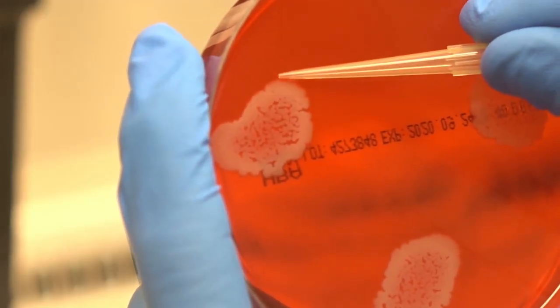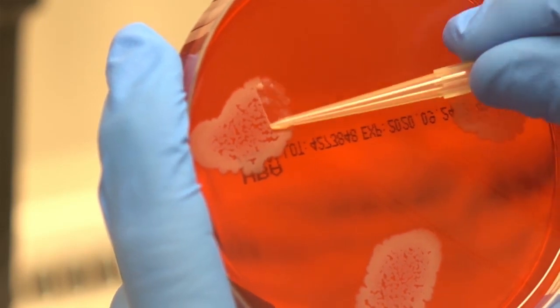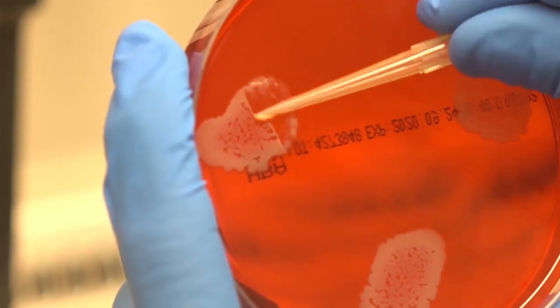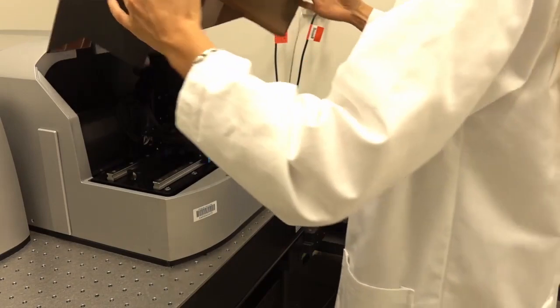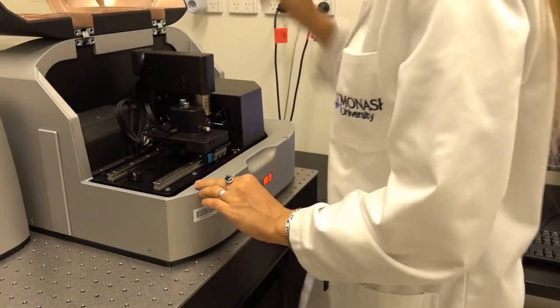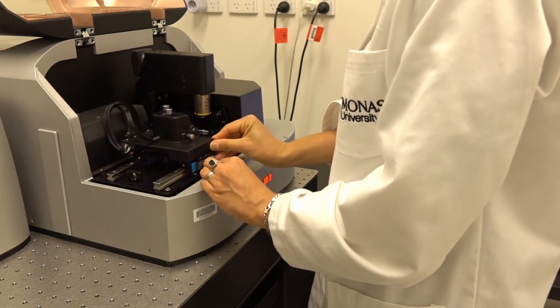Nanoscale size of bacteria significantly limits the available research tools capable of probing their chemistry. AFMIR allows us to do it in a non-destructive, observer-independent manner, even on a subcellular level.